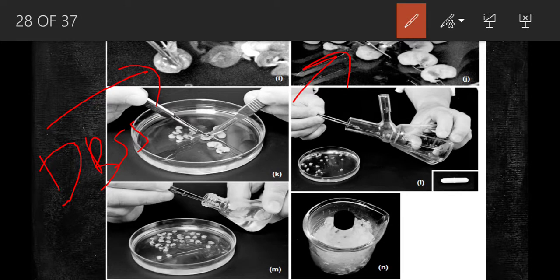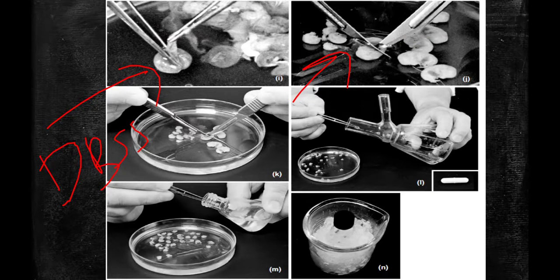You're not using just one pair, but two pairs of sterile forceps to avoid distorting the uterus and reduce pressure. At any point, if you apply too much pressure you'll kill the embryo. The main aim is to keep the cells alive.